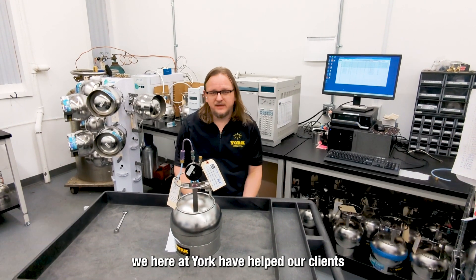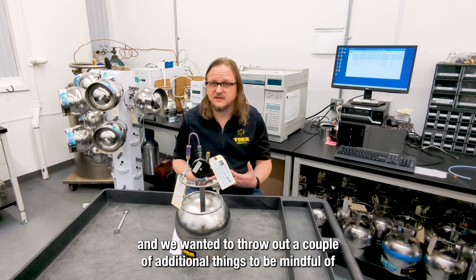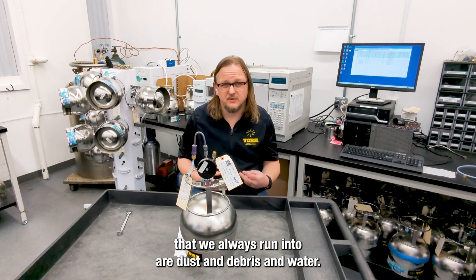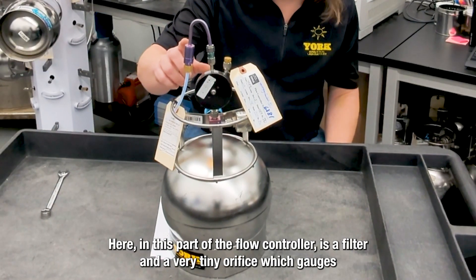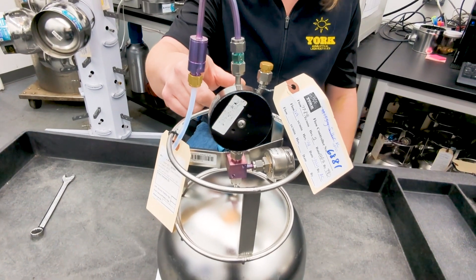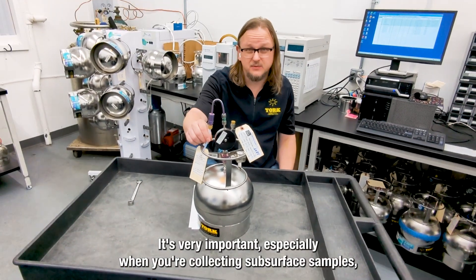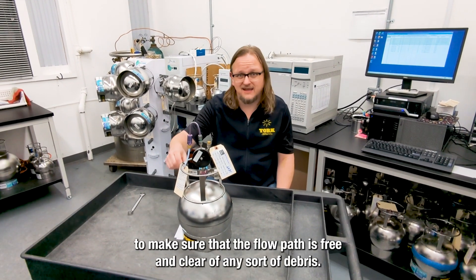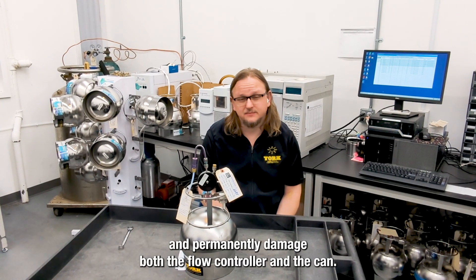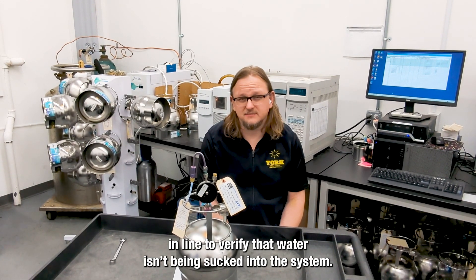Now that we have our sample collected, we here at York have helped our clients work through some pretty difficult situations out in the field. Two of the biggest culprits we always run into are dust and debris, and water. Here in this part of the flow controller is a filter and a very tiny orifice, which gauges how much flow goes through. This tiny orifice can be very easily clogged with dust or small particles. It's very important, especially when you're collecting subsurface samples, to make sure that the flow path is free and clear of any debris. Groundwater in particular can wreak havoc, contaminate, and permanently damage both the flow controller and the can. We at York always recommend that a trap is plumbed somewhere in line to verify that water isn't being sucked into the system.